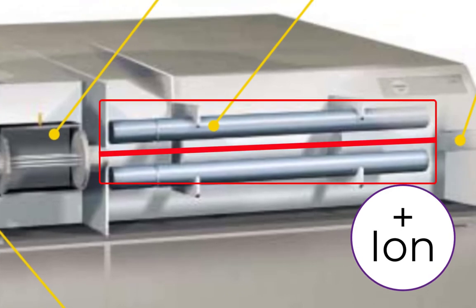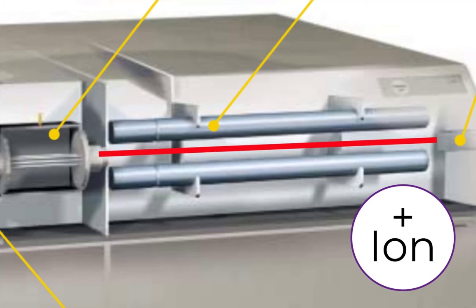The quadrupole, as the name implies, has 4 poles, and it uses a combination of radio frequency and DC voltage to act as a mass filter. So this thing can scan these voltages and it can eject every mass except one that it's looking at.